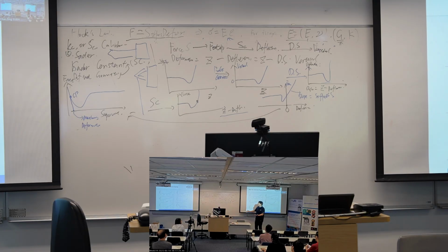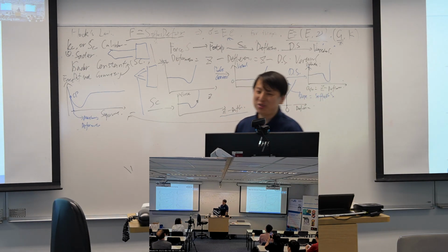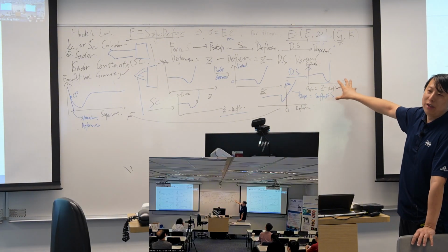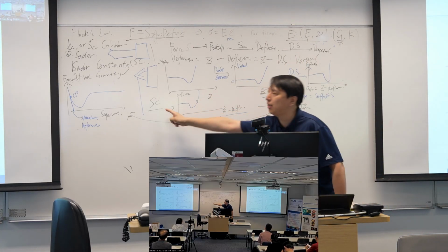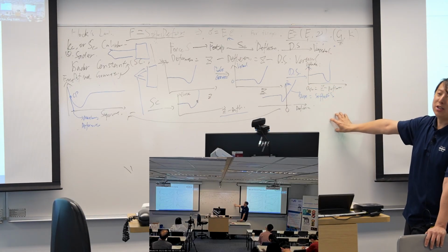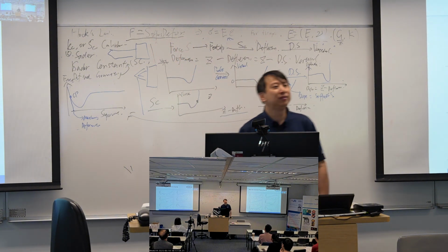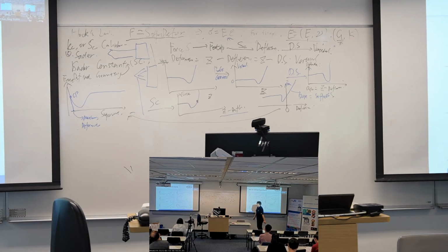Or of course, nowadays Bruker is the main AFM maker, so some reviewers would accept this kind of curve, but yeah, for me it's kind of stupid. Okay, so after this, we finally get our force curve done. We calibrate the deflection sensitivity, we calibrate the spring constant, we get our force curve. And the force curve is force against the deformation, and the slope is the stiffness. And then from the stiffness, we finish our phase 1 draw. Okay, let's take a 10 minute break, and then we go back to the next step.